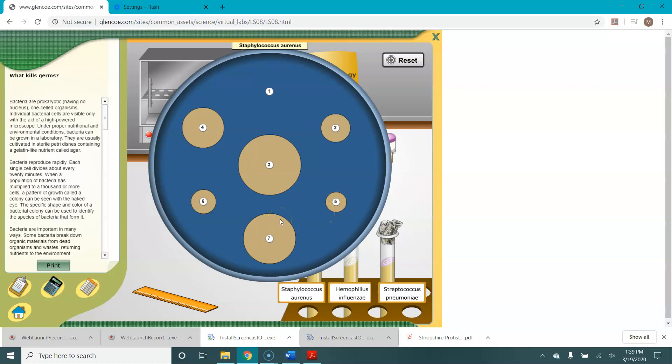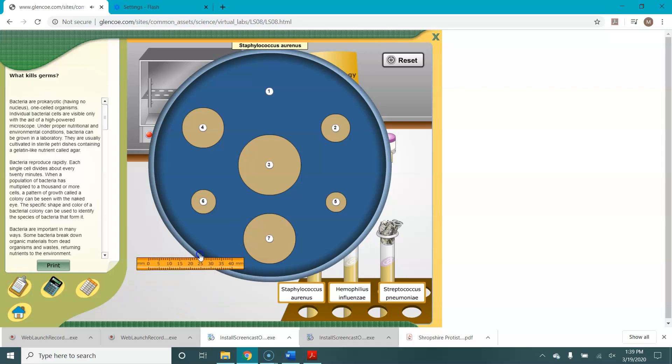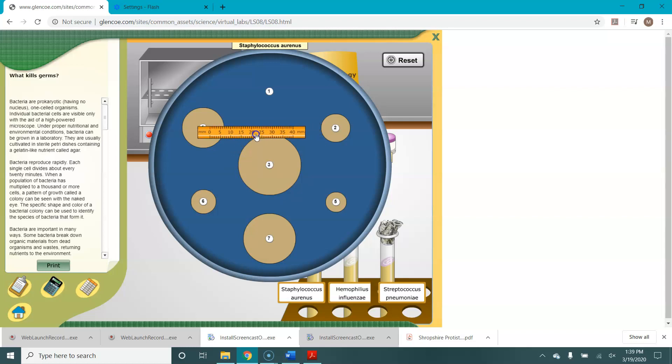So instead of just eyeballing this, we're going to collect some data. We'll do that by selecting this ruler down here and then dragging it up to our agar plate. So to measure these zones of inhibition, what you're going to do is drag the ruler to the edge of the paper disc and then measure from the edge of the paper disc to the edge of the zone of inhibition.